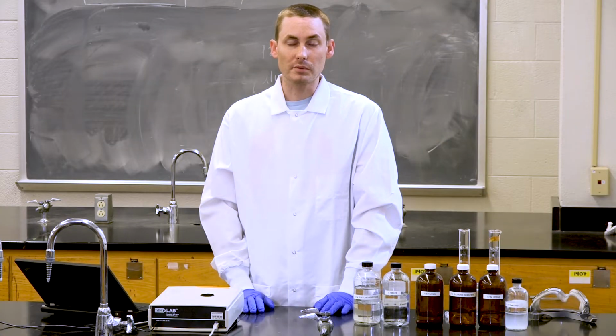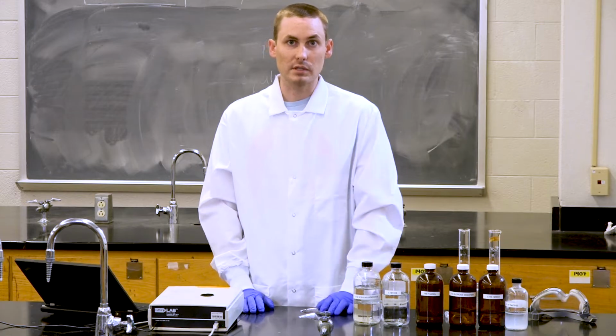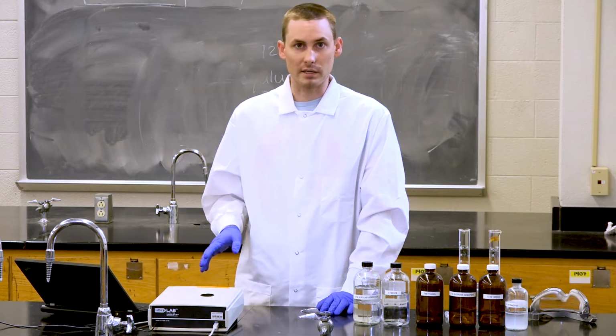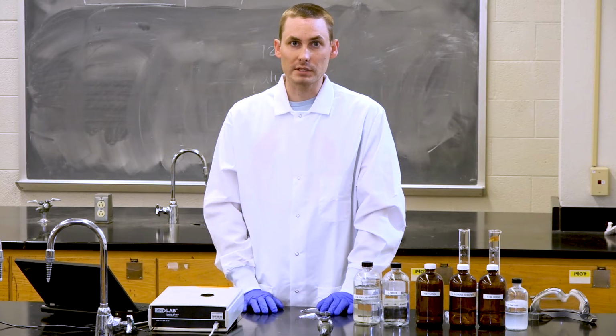So today we're going to be reviewing a number of solutions and measuring their conductivity using the microlab apparatus and a conductivity meter. But before we get started, we need to talk about safety.